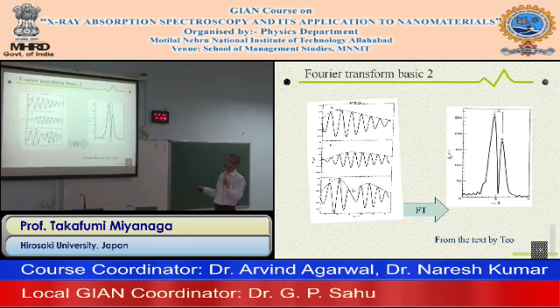In case there are two components, the first component is expressed by the sinusoidal function, and another one has different frequencies and a different envelope, from the A atoms and B atoms. So this spectrum has a node in this part. And after the Fourier transform of these functions, it has two peaks from the A atoms and B atoms.